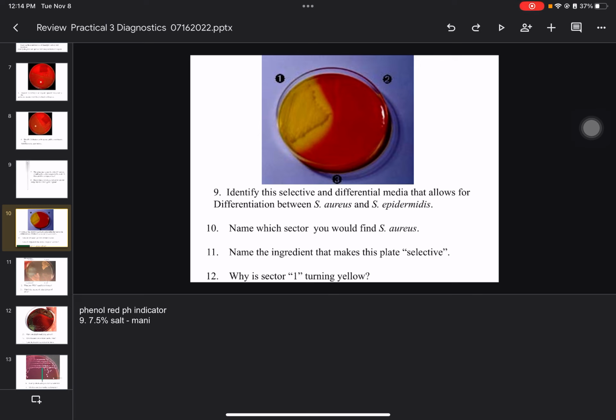If it grows on this plate, give me a word or two words that would describe the organism. Pathogenic? Not pathogenic. Is it positive for mannitol? Well, hold on. Halophilic's a good one. Is it positive for enteric? Nope. Fermentation? Nope. Staphylococcus? Yes, that's another one. You could say halophile. You could say gram-positive, catalase positive, right? There are some words you can use here, but you can't say all fermentative because it's not.